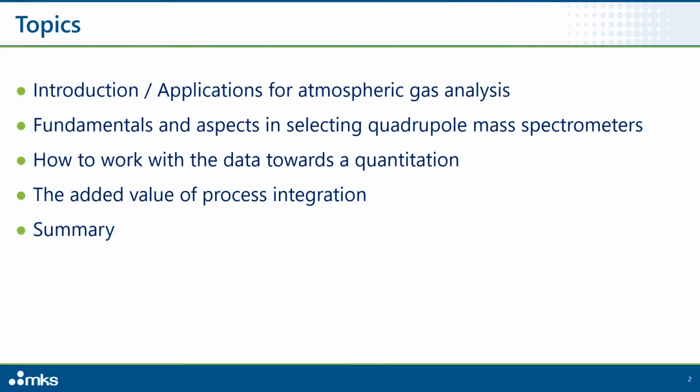In our session, we are discussing several aspects regarding the use of mass spectrometers to analyze atmospheric gas probes. We will discuss a few fundamentals on QMS systems and criteria for the instrument selection. We will also give you some guidance in case the quantitation of a gas mix is required. And we will also cover some aspects of the system integration and its value for the application.